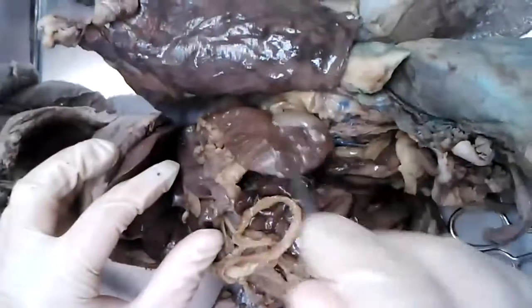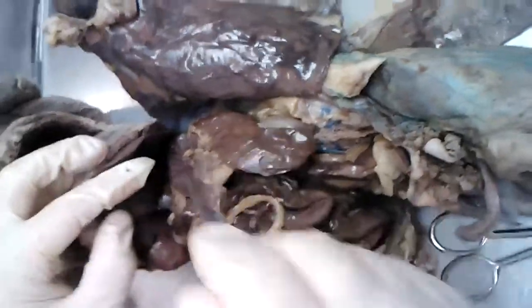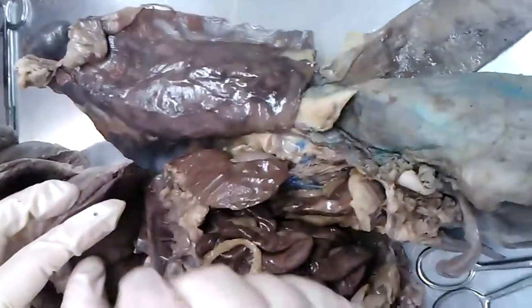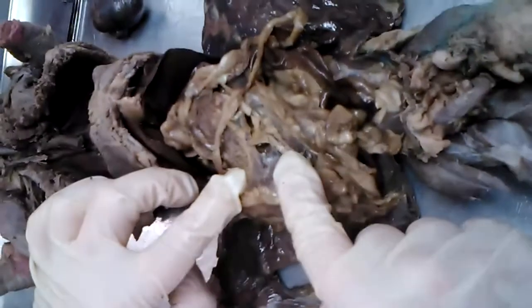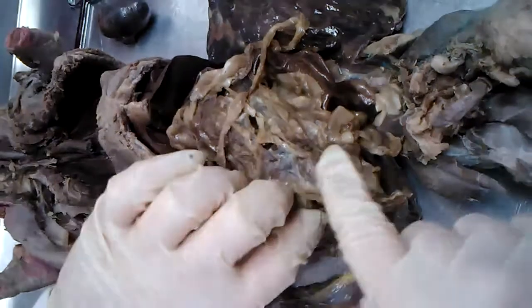Over on this side, this big organ right here was the spleen. Then curling around in this fashion, this is the stomach, going right through here. The big apron of tissue we see here, this is called the greater omentum. And I'll pull that back out of the way now to expose the small intestines.